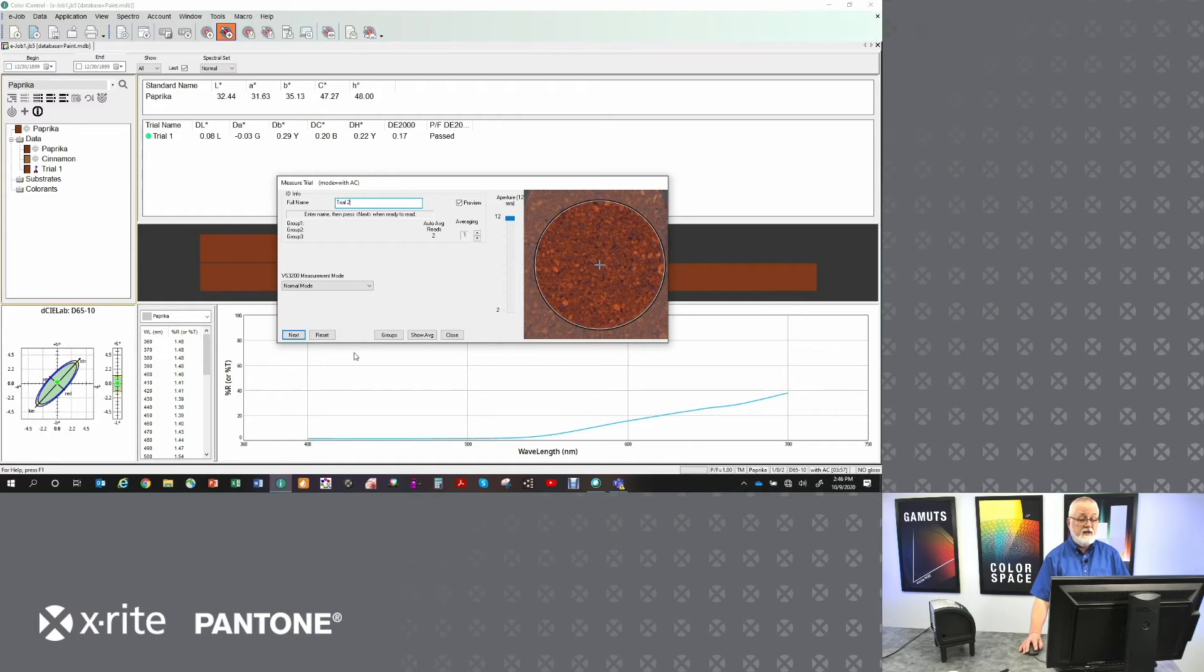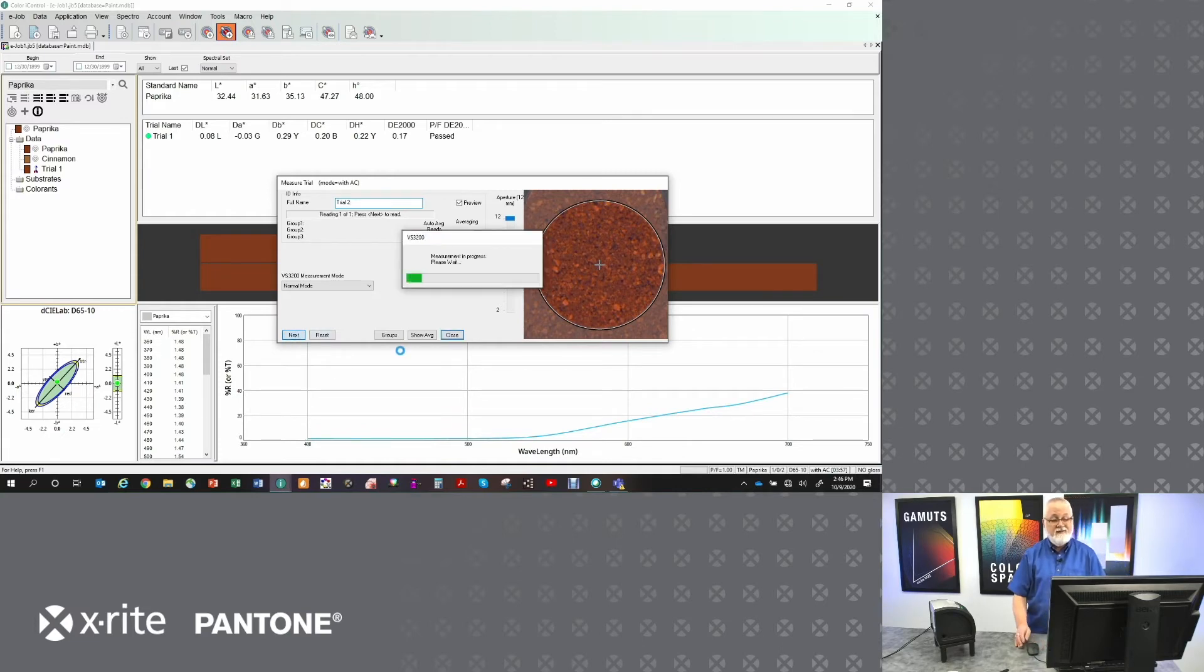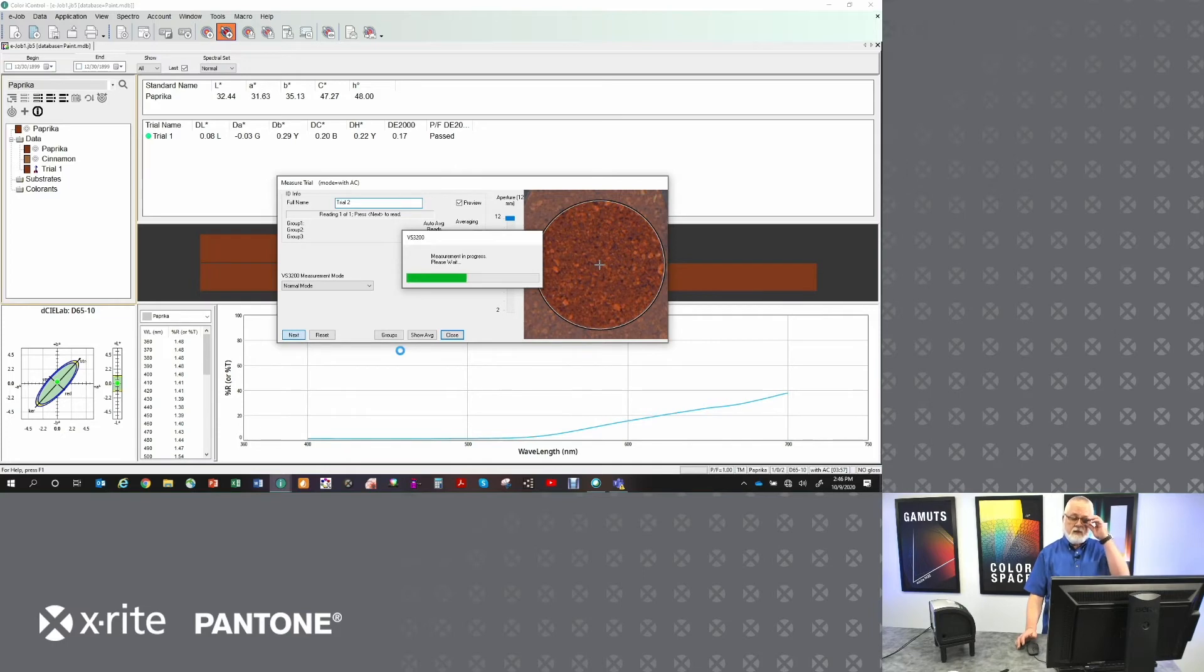I'm going to give it a name. I'm going to hit next, and the instrument's going to start taking its measurement. Now, an image-based instrument is slightly slower in measuring because of the kind of instrument that it is.